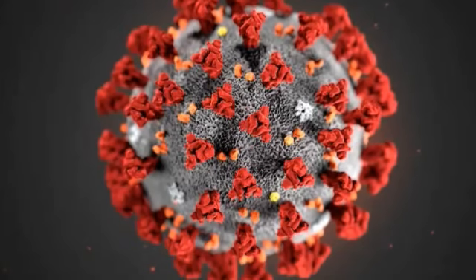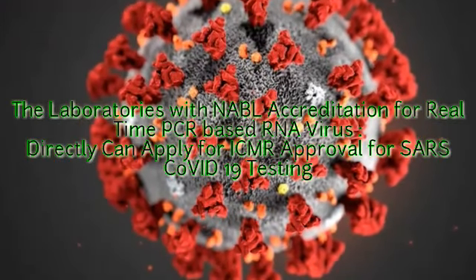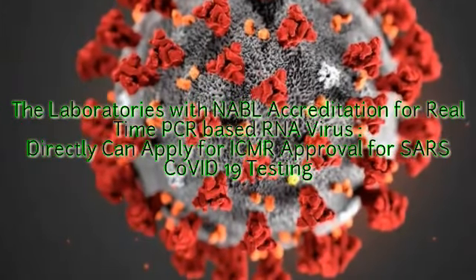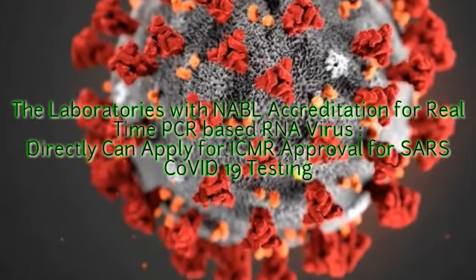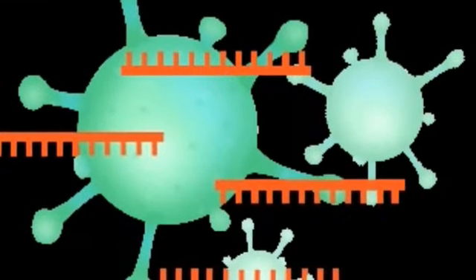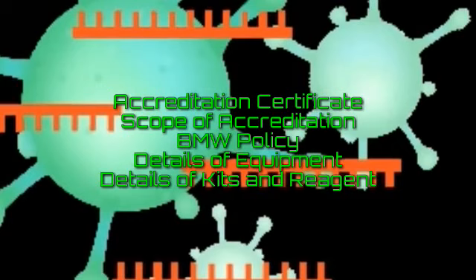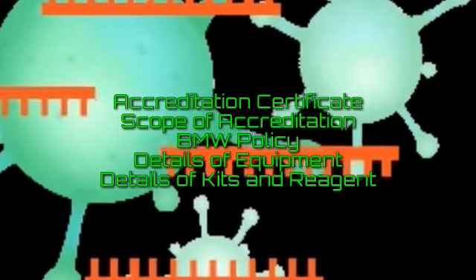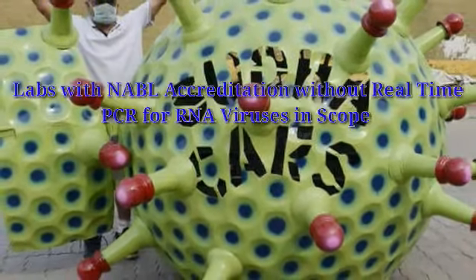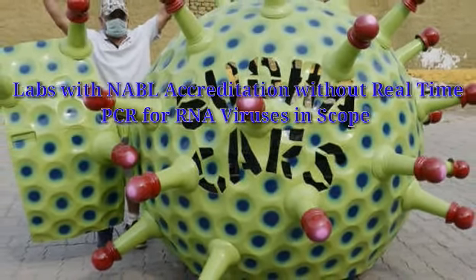Now, as per the communication from the Government of India, those laboratories which have NABL accreditation for real-time PCR assay for RNA virus can directly go for ICMR approval, and they can start the testing at their facility. For this purpose, they need to submit the NABL certificate and scope of accreditation to ICMR for getting permission for COVID-19 testing. The next scenario is the labs which have NABL accreditation, but it doesn't cover real-time PCR for RNA.